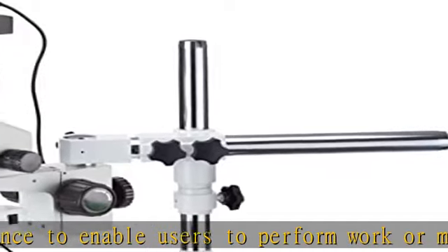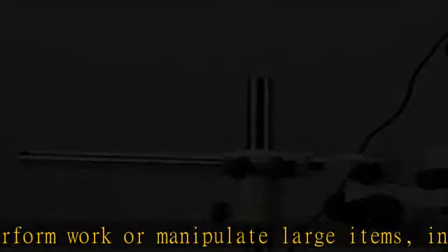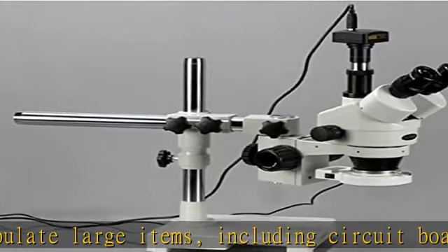Trinocular viewing head with pair of 10x super widefield eyepieces, adjustable interpupillary distance, fixed 45 degree vertical inclination to reduce eye and neck strain.